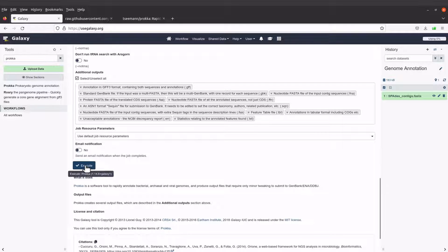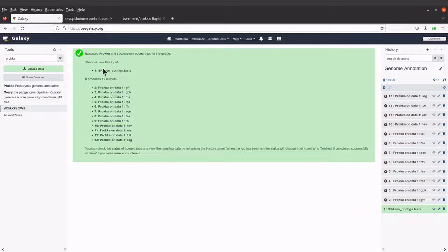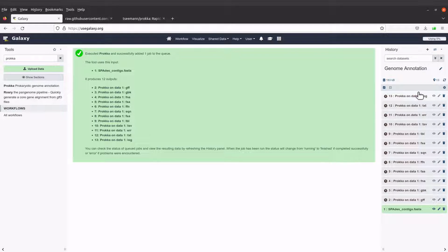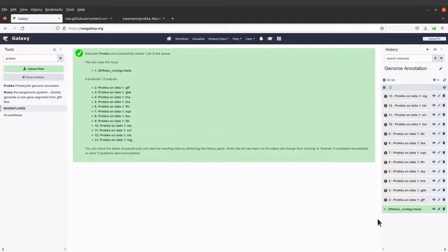Once we are done, click the 'Execute' button. You'll see a message showing the tool, the input file, and the output files that will be generated — Prokka generates 12 output files. Come to the right side to check the progress. The background color will be gray when the job is in queue, orange when processing, and green when complete.